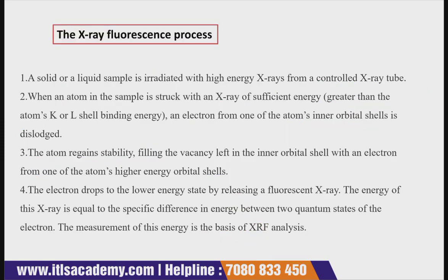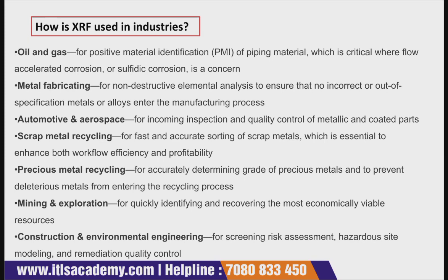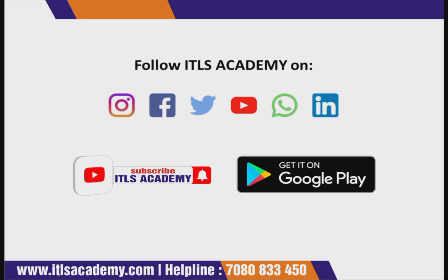Then at last they can ask you about the processes of X-ray fluorescence spectroscopy, and of course with the help of a diagram. So this is a diagram to answer that. And at last, how X-ray fluorescence spectroscopy is used in the industries. So that brings to the end of the lecture.